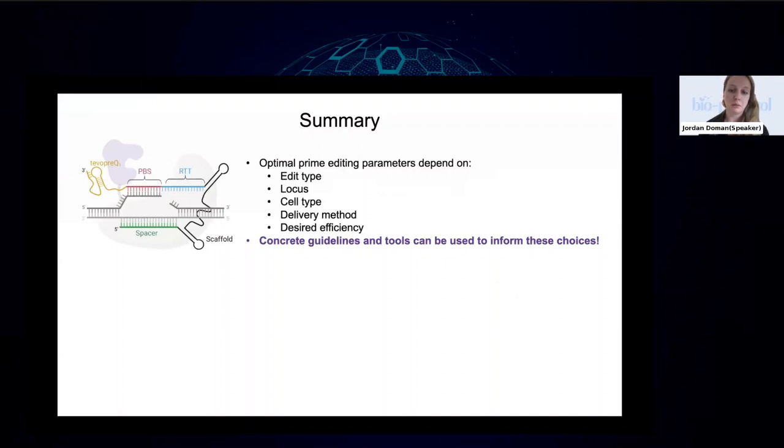This can all be very overwhelming, but I think the main takeaway from this webinar is that there are concrete guidelines and tools that you can use to make these choices. You don't have to screen every single thing to get a usable amount of editing efficiency.